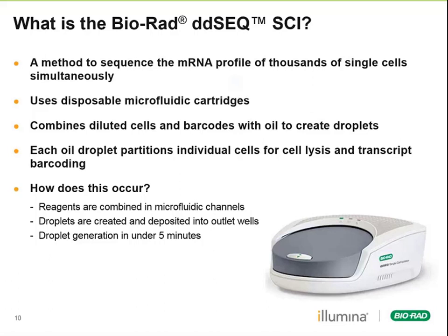As I mentioned, we're using a microfluidics cartridge so that individual reagents are streamed in, droplets are created, and then they're streamed to an outlet well. One cool thing about this is droplet generation happens in under 5 minutes for each cartridge you run.